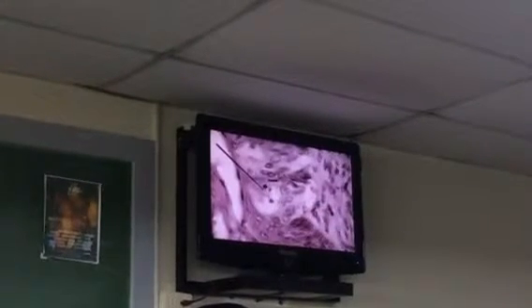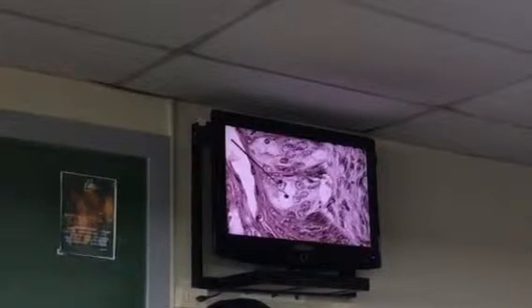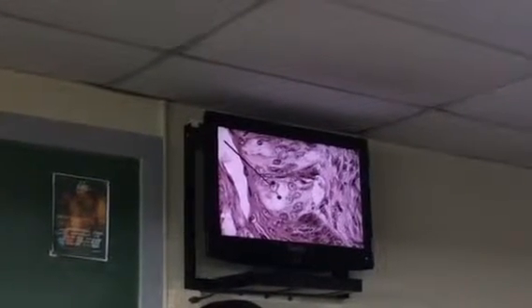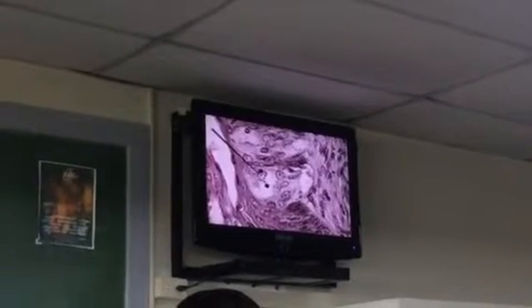We're not going to identify the cells. It's sufficient to say that the most important cell in the taste bud, of course, is your gustatory cell. Right? That's your receptor cell for the sense of taste. Okay? So please, again, look at your papillae, circumvallate. Okay, hindi natin ma-identify alin dito yung gustatory at alin dito yung supporting.